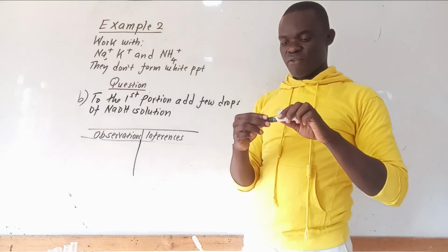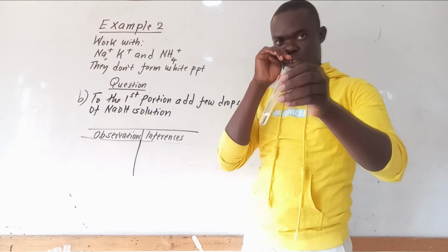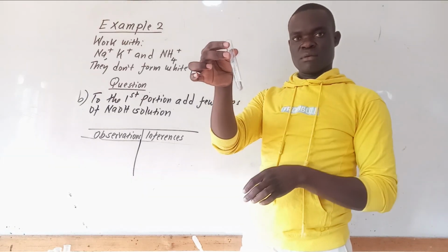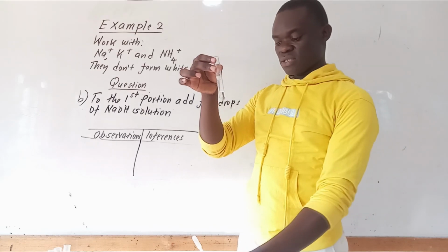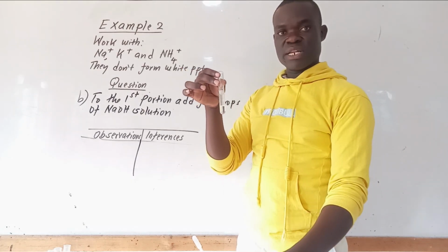Few drops of sodium hydroxide solution. So I will take the first portion. So I will add few drops of sodium hydroxide. This is sodium hydroxide solution. I have 4 different solutions here.